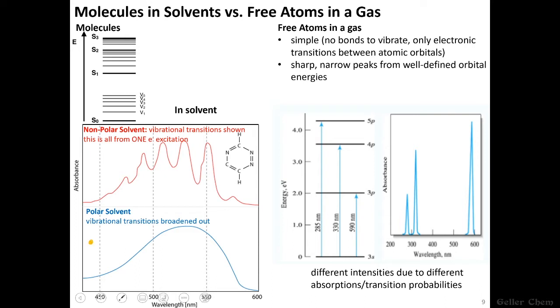Well, you might think that that's not a big problem, because this peak here is nowhere near this peak over here, but the issue is that these peaks can extend, again, over hundreds of nanometers, so there's a very real chance that we'll get this convoluted situation where different peaks are overlapping with each other, and the instrument can't distinguish what's absorbing what wavelengths.